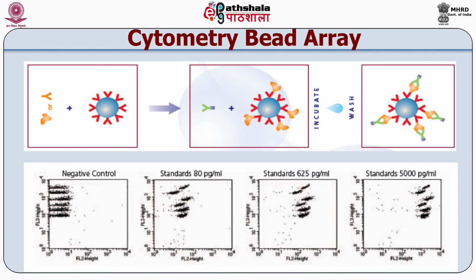Fluorescent microspheres offer a new technology involving flow cytometry. A biomolecule can be attached to a bead and its interaction with other molecules studied, for example, the binding of an antigen to an antibody. A particularly powerful application is the use of multiplexed arrays as shown here, in which sets of beads, each with a different fluorescent intensity, are attached to a different antibody.